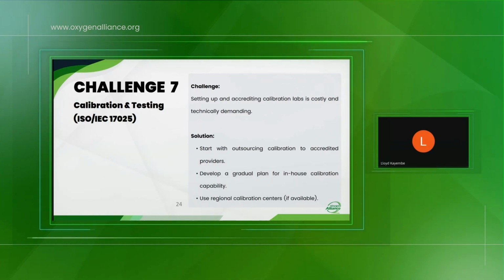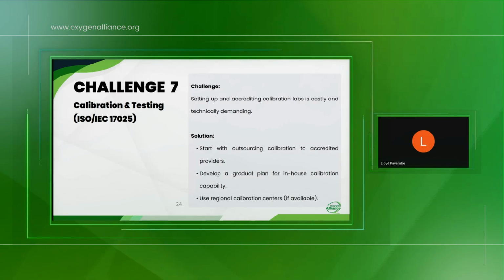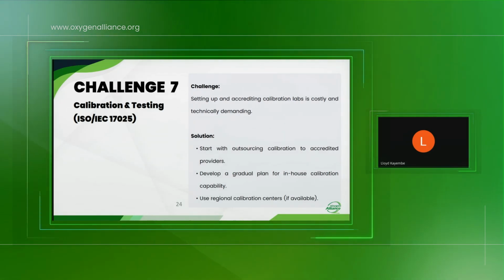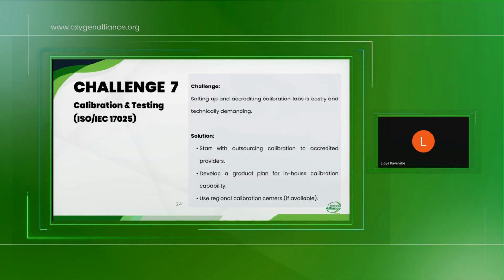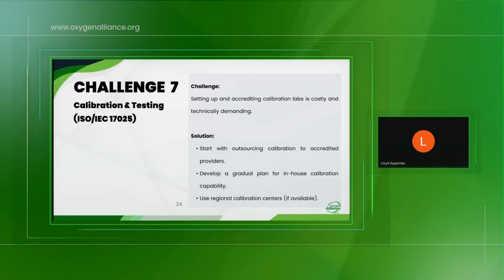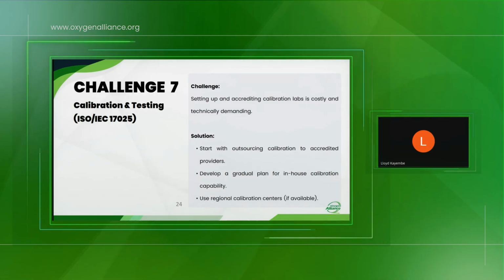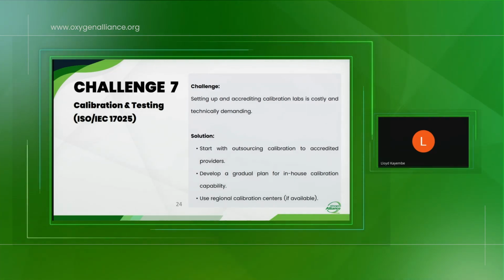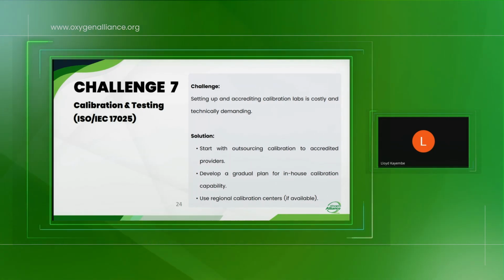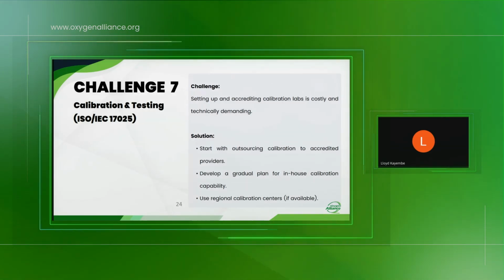Yeah, just to add on what Engineer Philip has said, you should view the CMMS and the LIMS as different systems, because the LIMS is mainly used for tracking or improving the workflow around the laboratory itself. So in the lab they are used to collect tests and give the results.